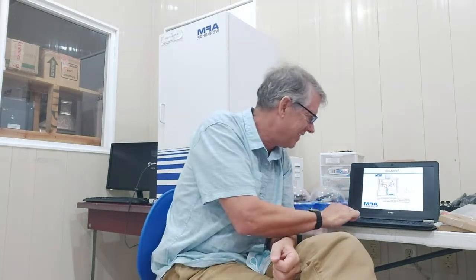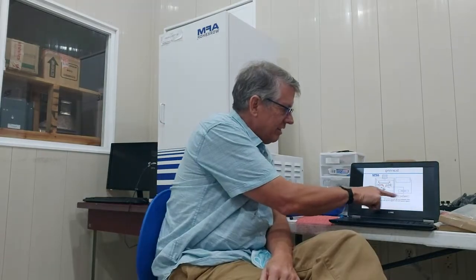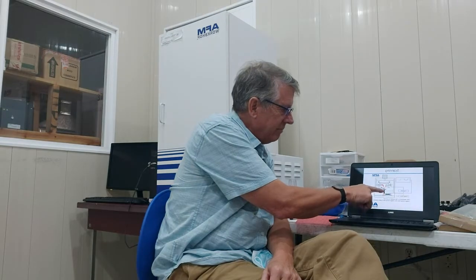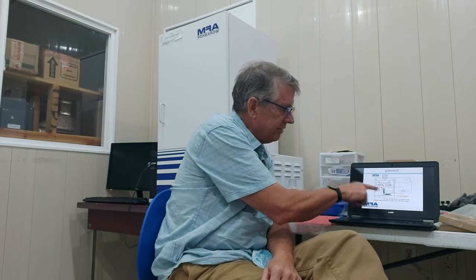All right, we're almost ready to scan a sample. So here we go. Now we're going to turn on this voltage ramp on the Y ceramic. And we have this feedback loop turned on. And you see what's going on there is the cantilever stays bent the same amount.